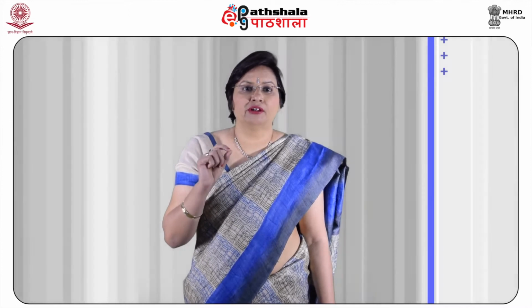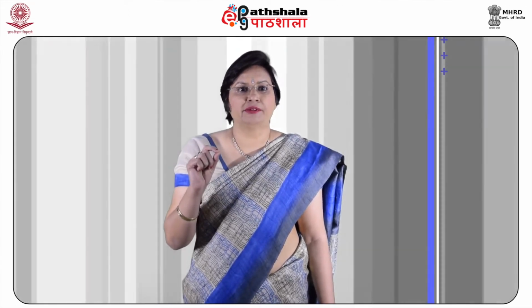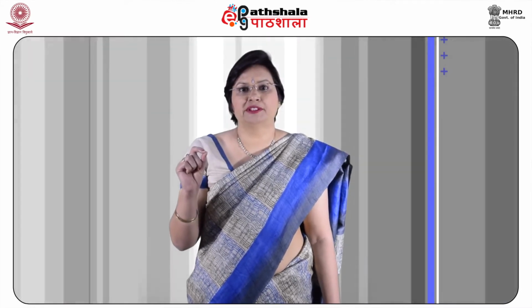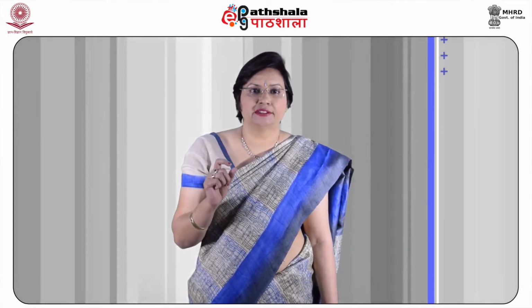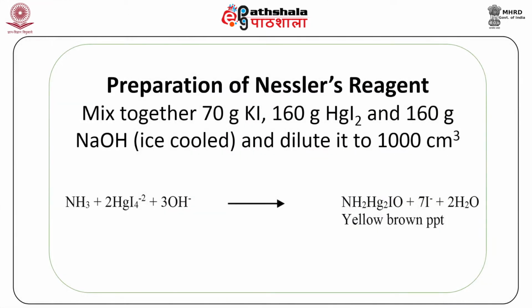Chart 1 and chart 2 describe the distillation of a colored sample and determination of ammonia in a colorless sample respectively using this Nessler's method. You can see in chart 1 that the water sample is distilled with NaOH and finally collected over 0.1 normal sulfuric acid and made into a final volume of 250 cm³.